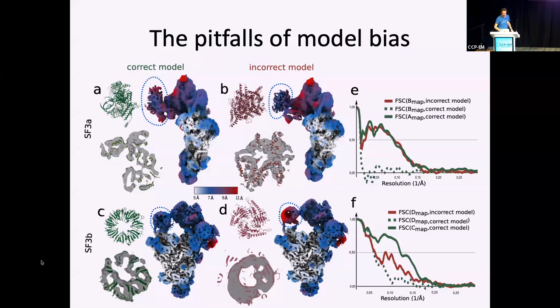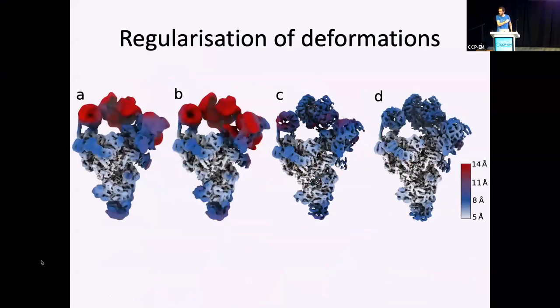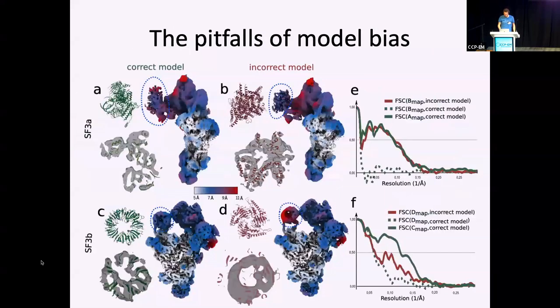But based on these observations, what's only implemented in the GUI is this approach. So we're sacrificing a little bit of resolution perhaps, but at least it's safe. You won't be inventing wrong things.